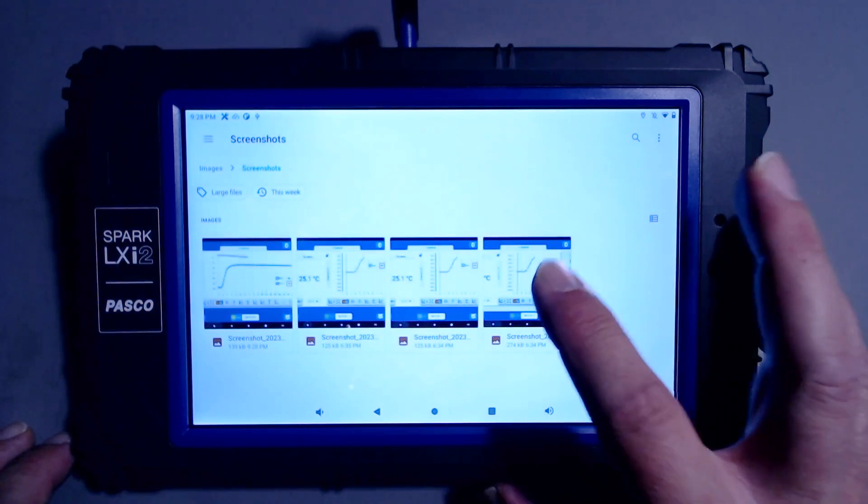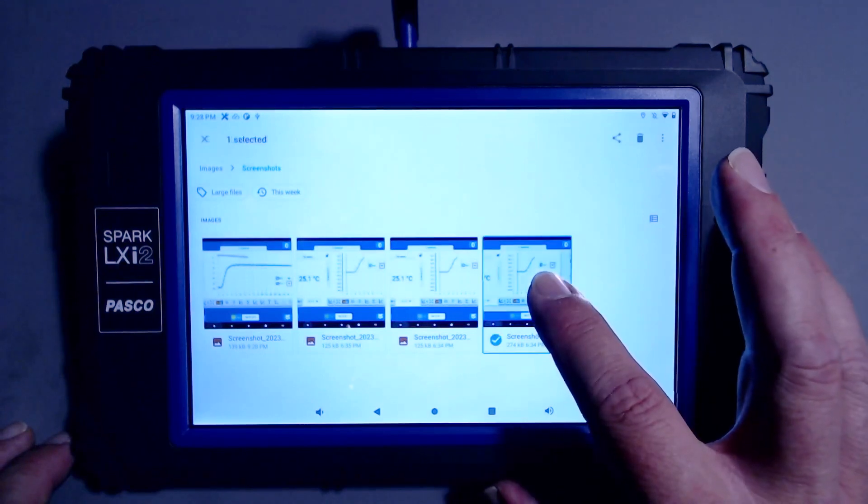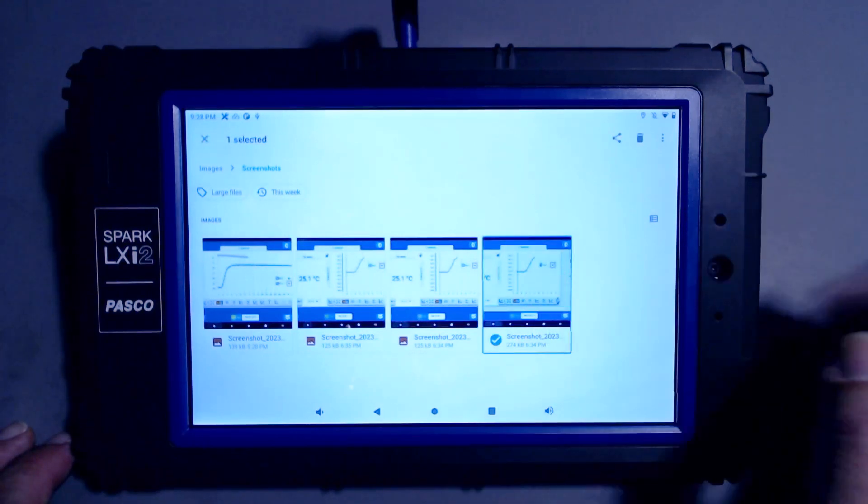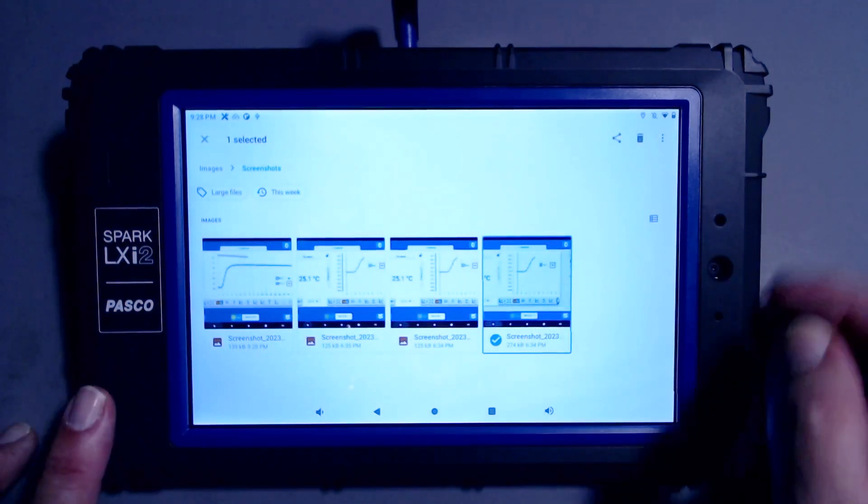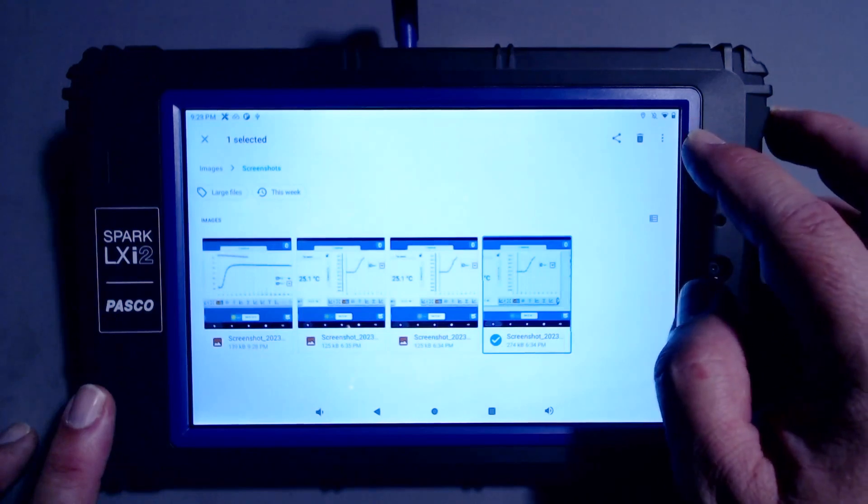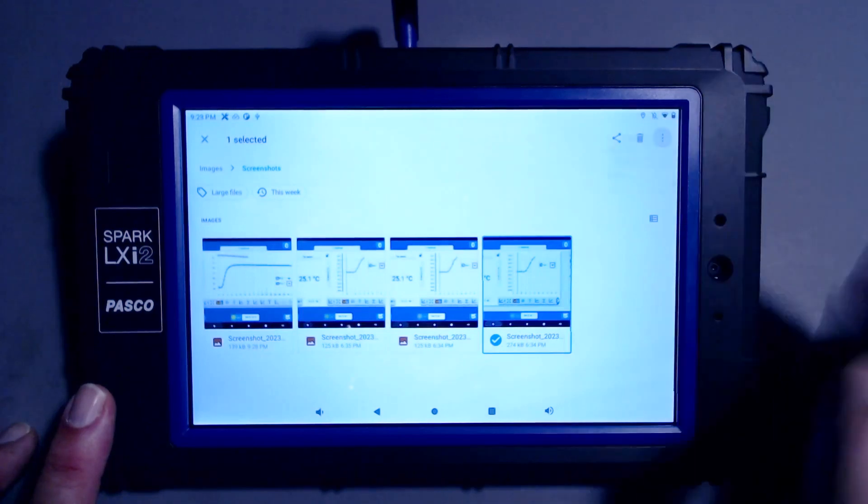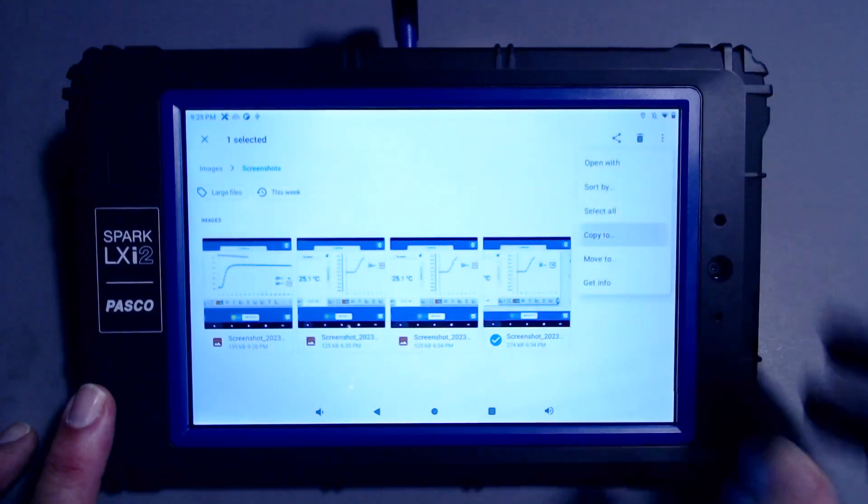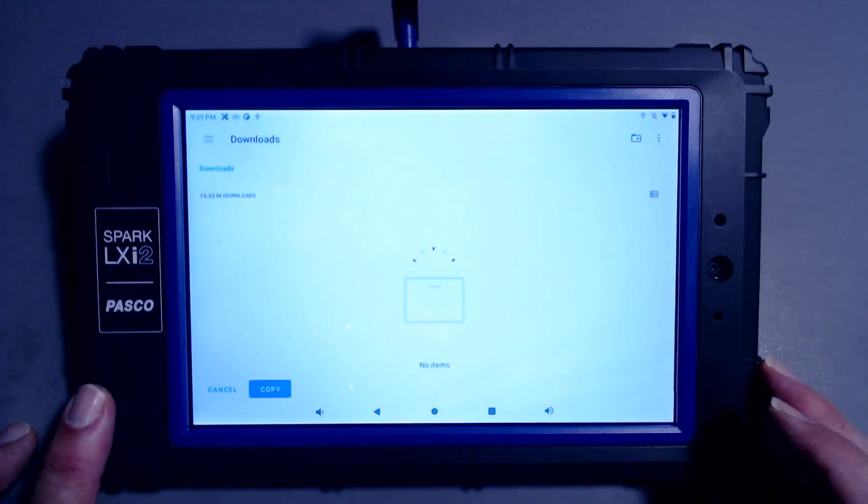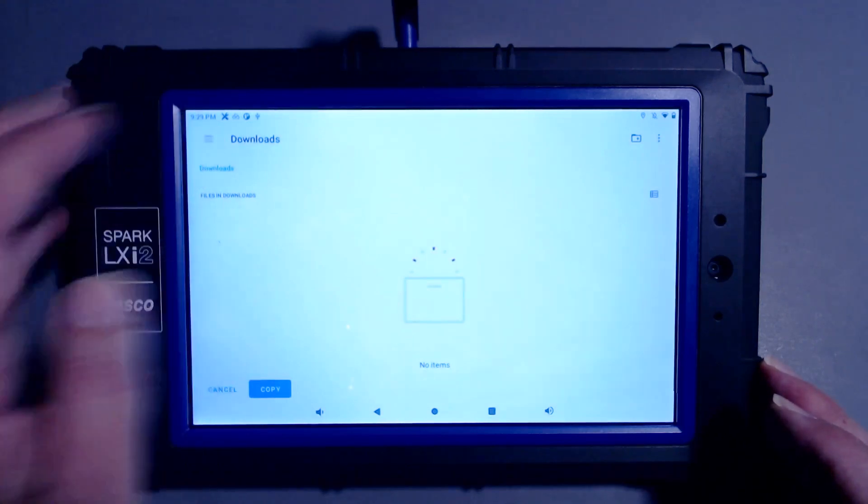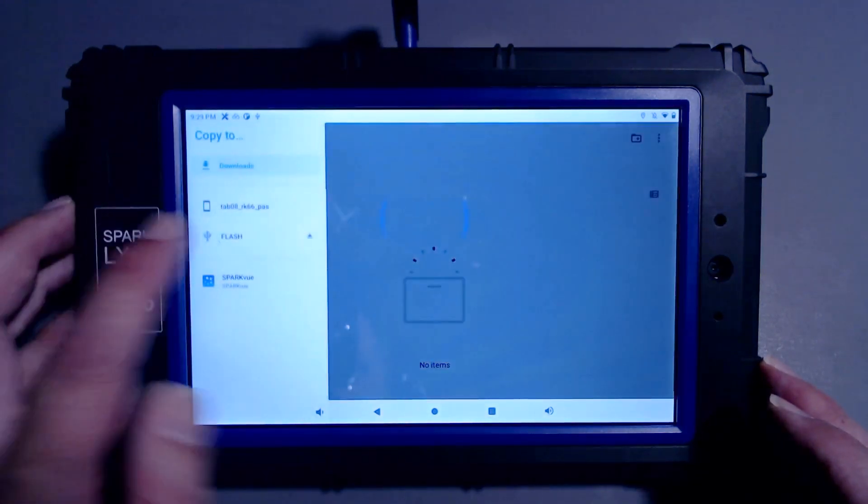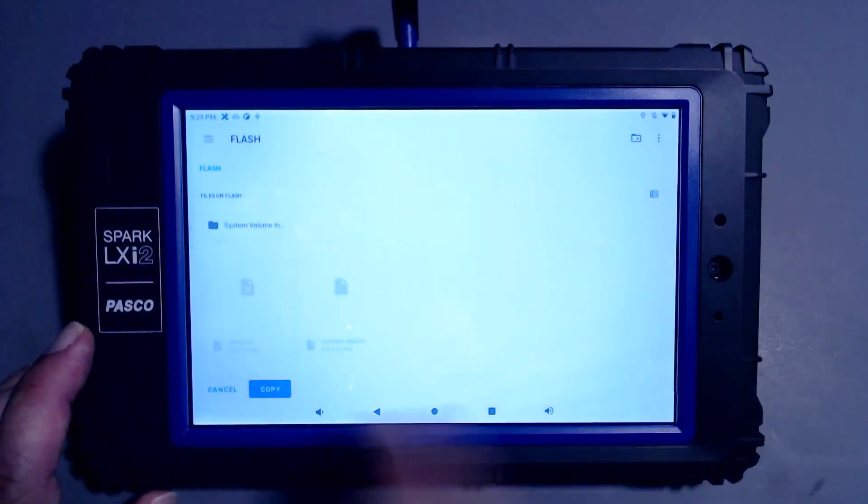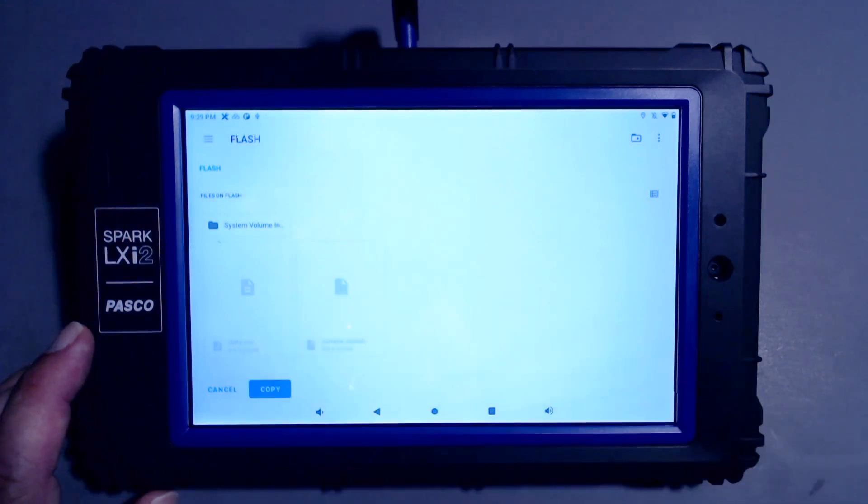I can select the appropriate screenshot, tap and hold it, and then come up to the three-dot menu in the upper right, and choose Copy To. For the destination, I'll select my USB flash drive, and select Copy.